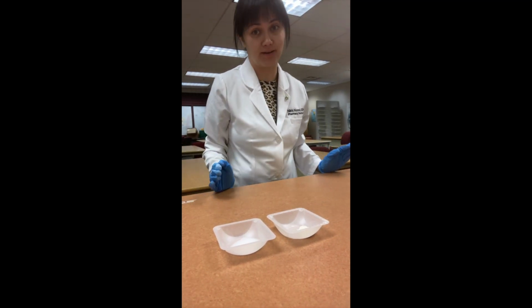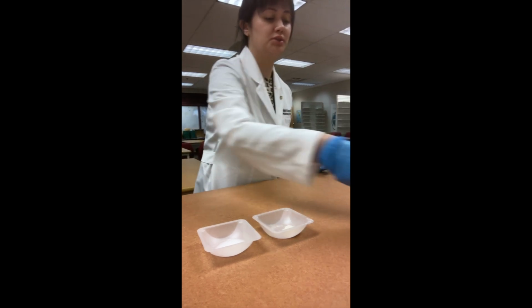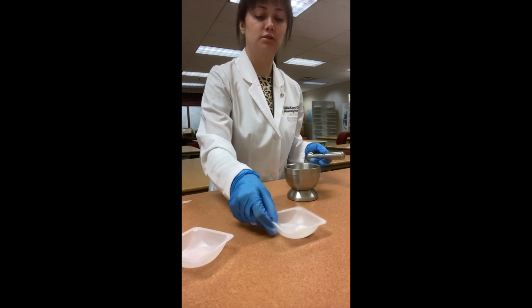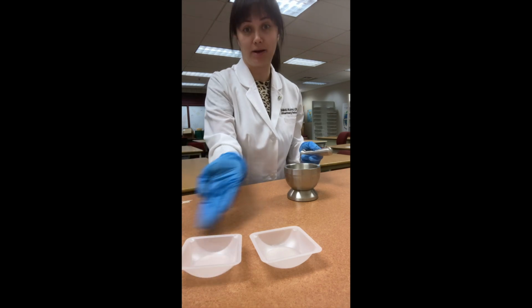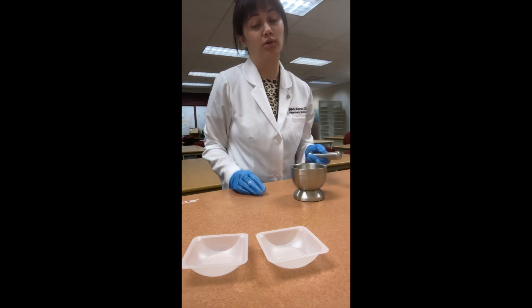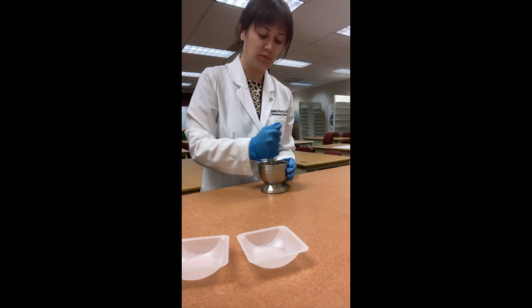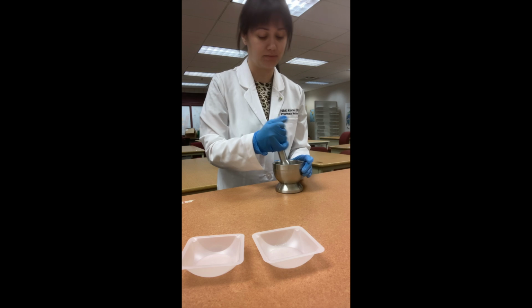So now that I have both of my powders measured out within our 5% error range, now we want to triturate, which is when we're going to reduce our particle size of our powders, mix them up using a pestle and mortar. So put that in there, put that in there. And these are about equal amounts, so we don't have to use geometric dilution, which is what you would use if one of these powders was much smaller in amount than the other. And that's when you would try to keep adding them in at a 1-to-1 ratio. Just make sure everything is well incorporated.